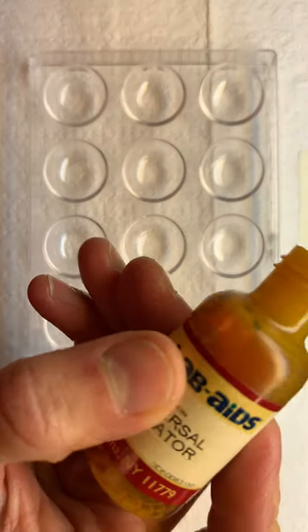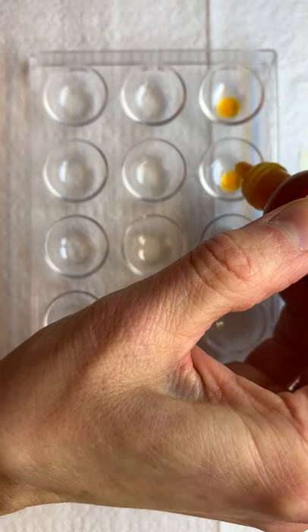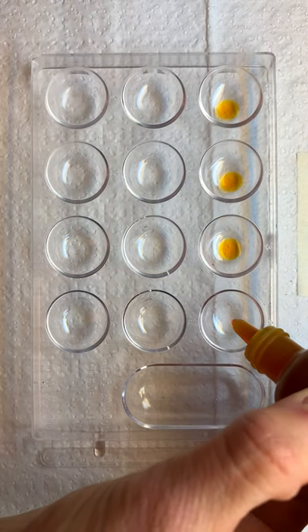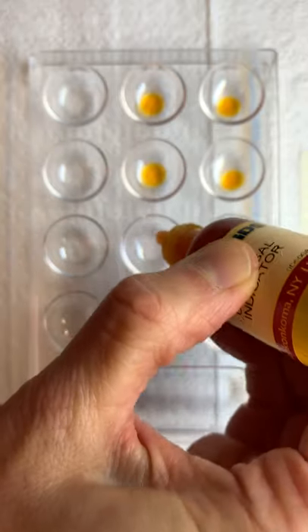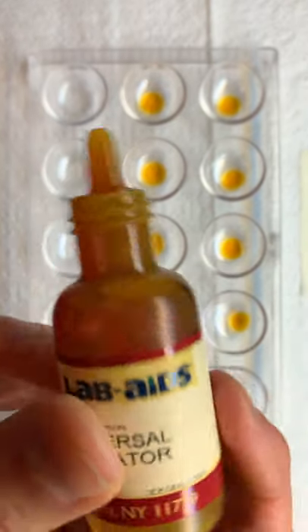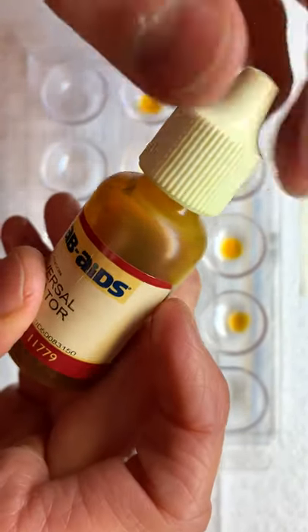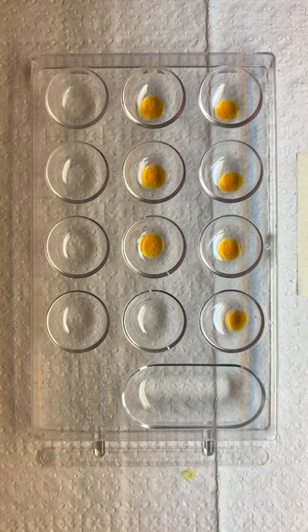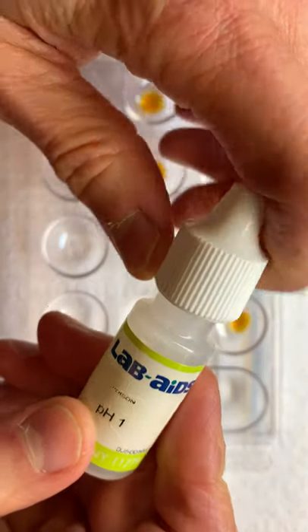We're going to take one drop of the universal indicator in all seven wells, and the word universal should give you a hint that this means it will go from 0 to 14. Universal indicator. And now we're going to do what we did before, which is to add each pH to the well. So pH 1.